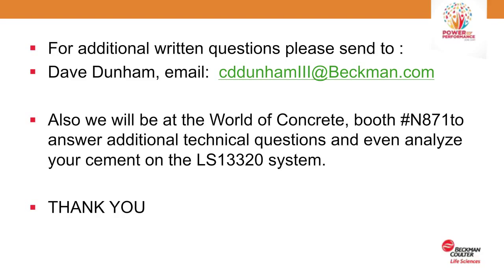The auto rinse is computer controlled. The module has a high level, top level optical level sensor. So we drain and fill the module 3 times, or this is actually selectable by the operator. Cement rinses pretty easily in cement components. So typically you would need no more than about 3 rinses of your module, in other words, a fill and drain.